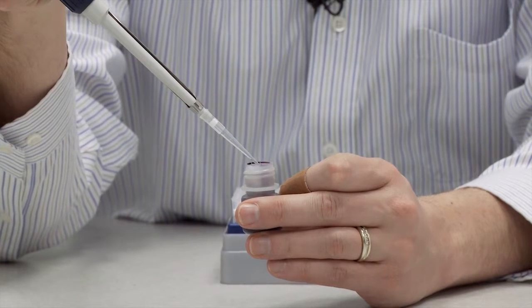Maintaining accuracies, maintaining the quality of the product, and assuring that you get everything out of your tip that you need every single time.